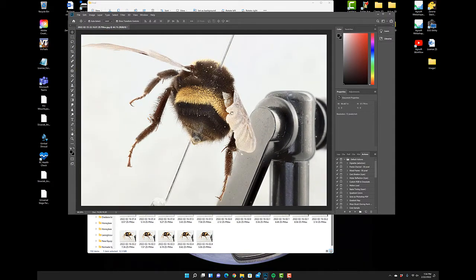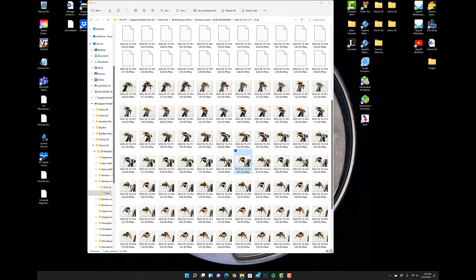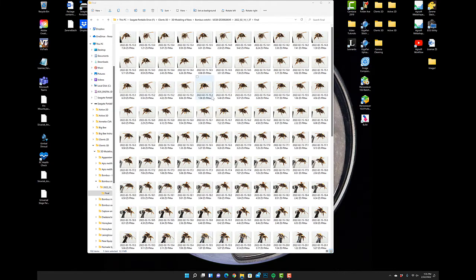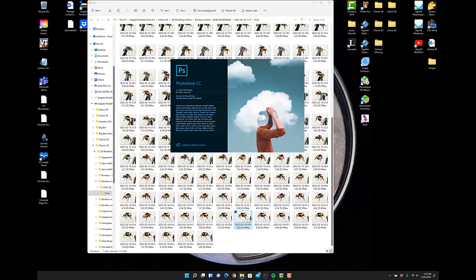So one thing I would recommend is, let's say you do have an image that does have streaks because you stacked it in the wrong direction. What I would do in that situation is I would first refer to some image that you can use as a proxy. One that's generally just a good lateral view. So something down here where the stage is out of the way. Let's open up this file.